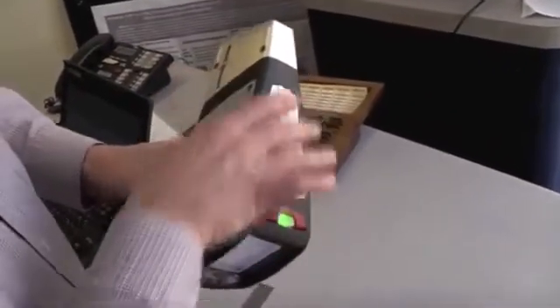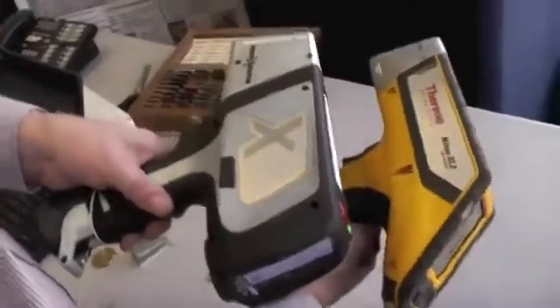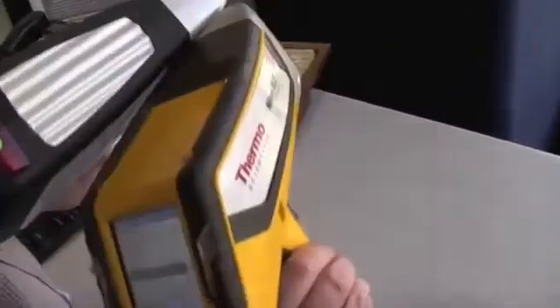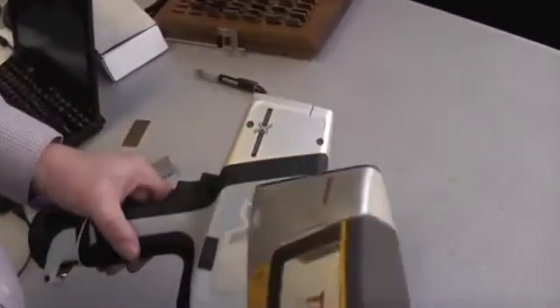The handle is much bigger to get a hold of. We're able to radiate heat primarily through this piece of metal up here, but also from the snout. If you look at the amount of exposed metal on our snout versus theirs, ours is longer on the top, longer on the bottom, and has a lot more surface area to let the heat out.